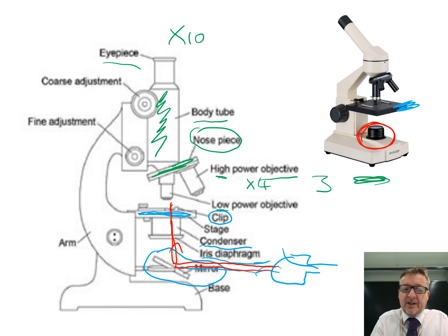On the left-hand side you've got the arm, which is used for carrying the microscope. You also have the coarse adjustment and the fine adjustment knobs.